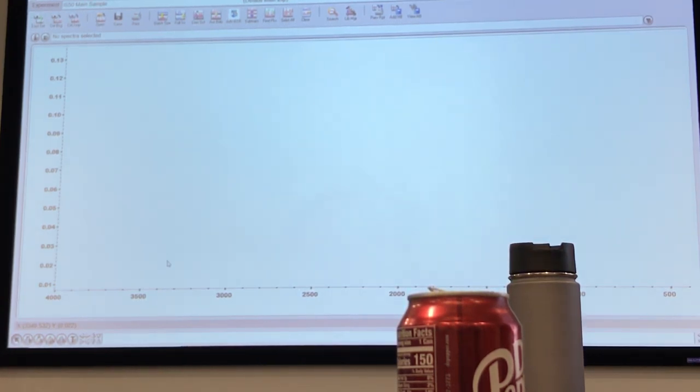Because some of the samples that I'm finding, I've only been getting like 70% matches, and it's really hard to determine if that's a good enough cutoff for determining the identity of that particle. One of the things you always want to do: you did a quick search and you get a match score of 70. If the match was to PE, and you have a standard PE spectrum, just subtract it out and see what's left.